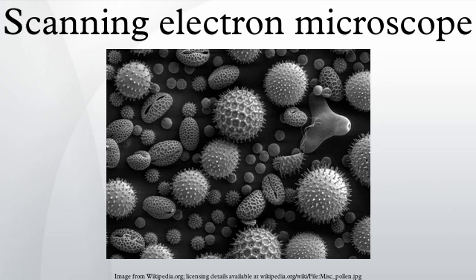When the primary electron beam interacts with the sample, the electrons lose energy by repeated random scattering and absorption within a teardrop-shaped volume of the specimen known as the interaction volume, which extends from less than 100 nm to approximately 5 micrometers into the surface. The size of the interaction volume depends on the electron's landing energy, the atomic number of the specimen, and the specimen's density.